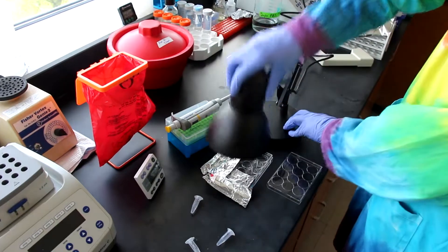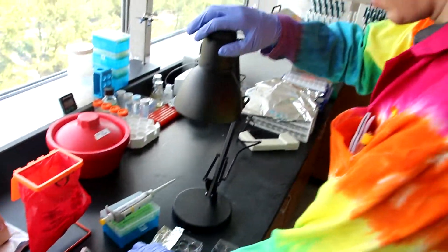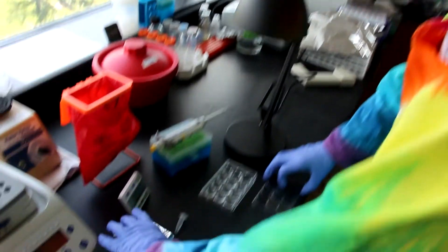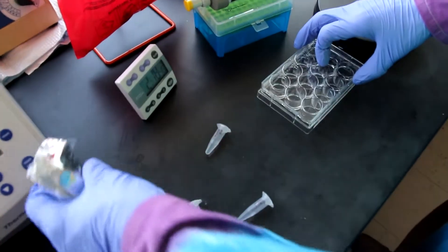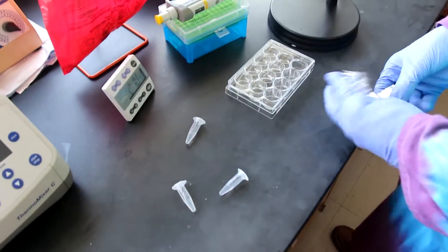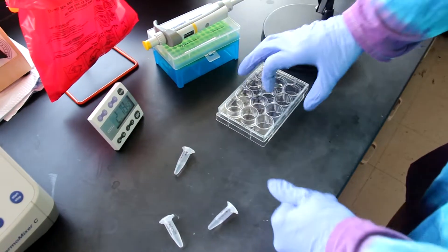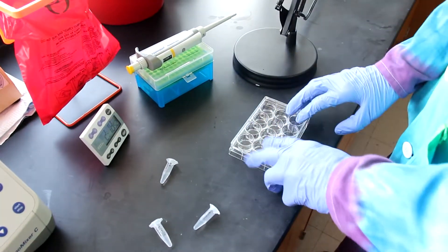When you're done, turn off the UV lamp, remove your pieces of foil, place them in the biohazard, and return the lid of your plate. You can then take your plate of cells to a plate reader to quantify fluorescence.